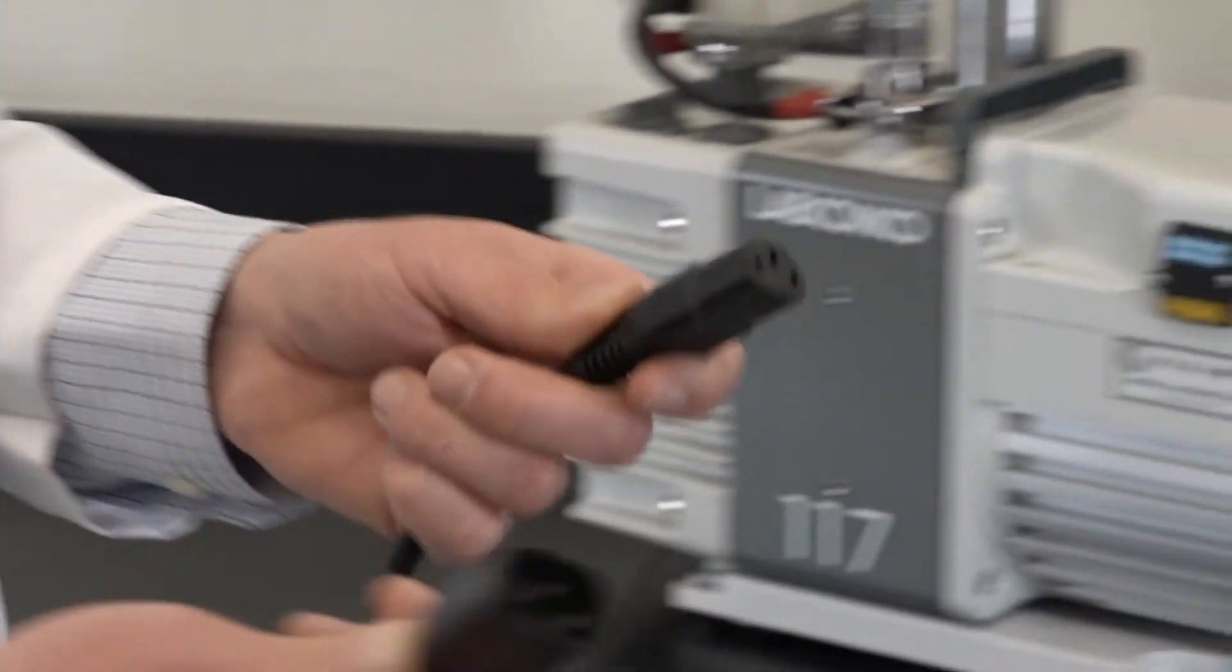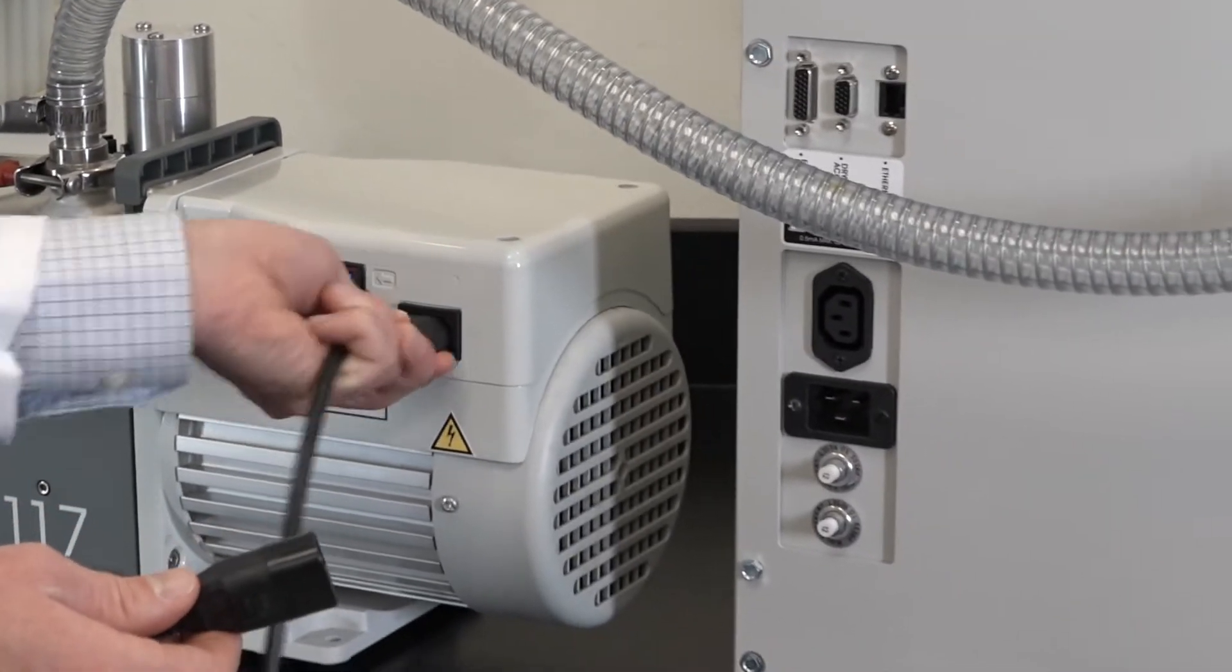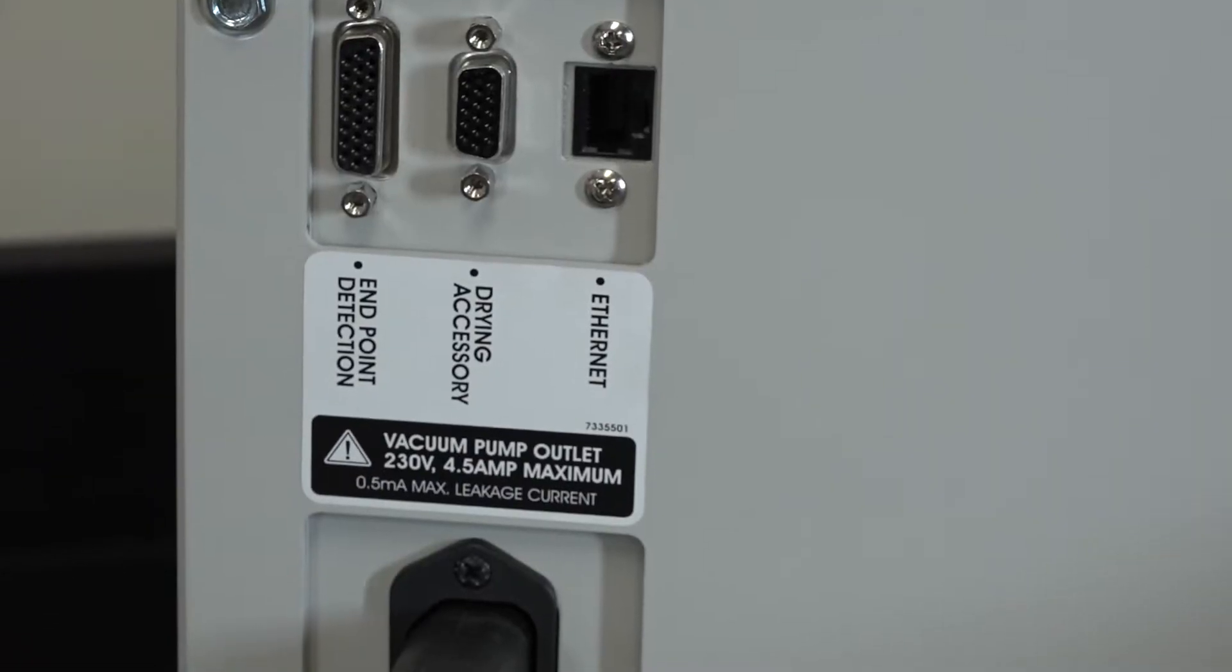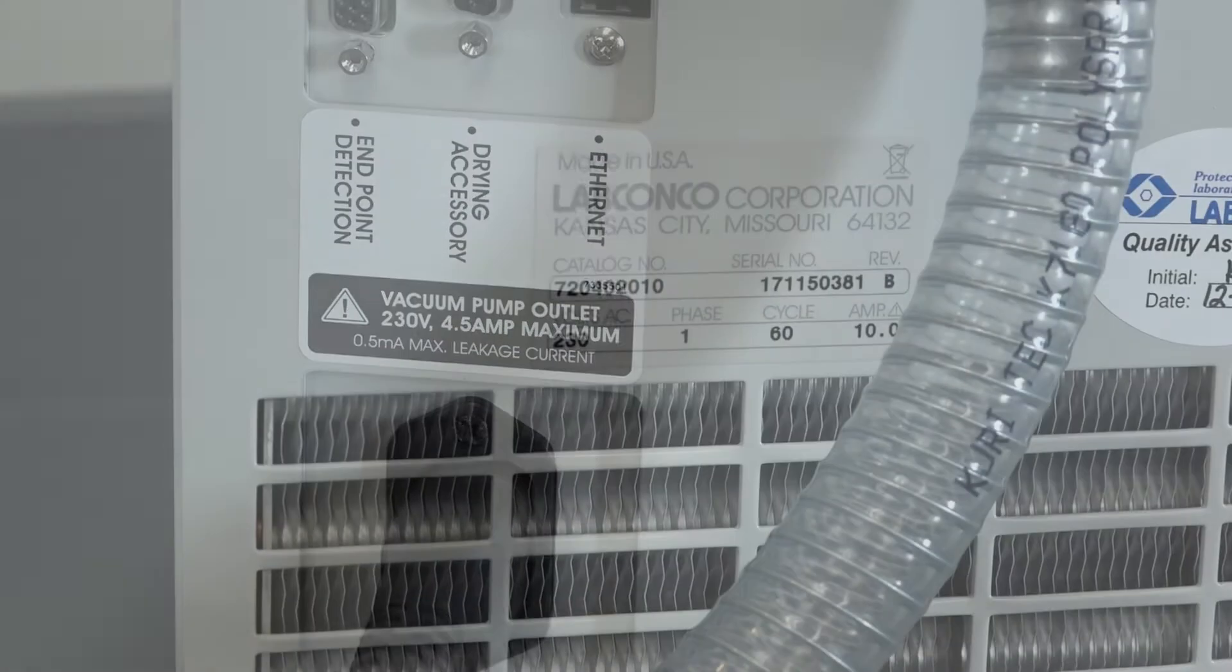Plug the vacuum pump into the outlet located on your Freezone so that your freeze dryer can control the vacuum level. The electrical requirements of the vacuum pump and the Freezone need to match.